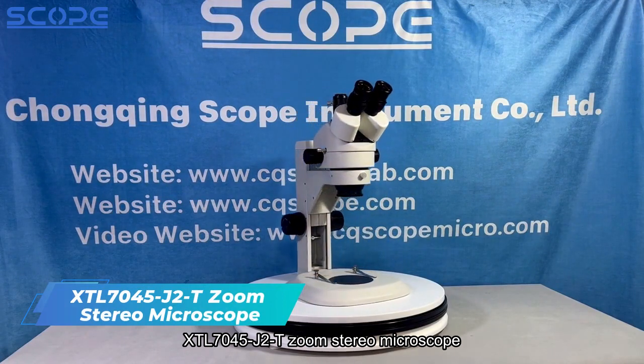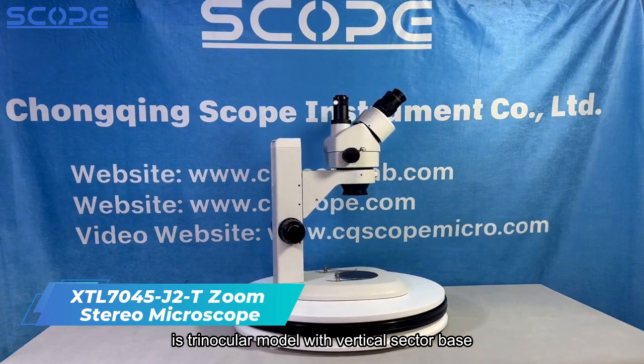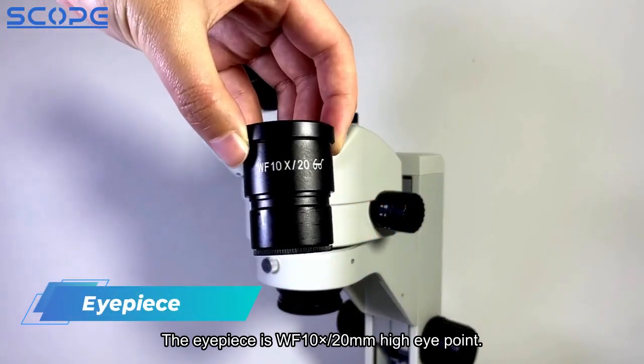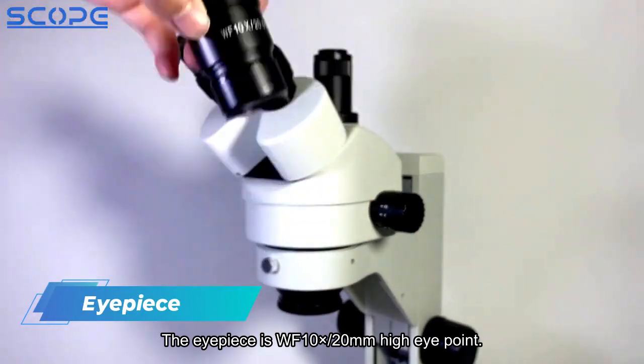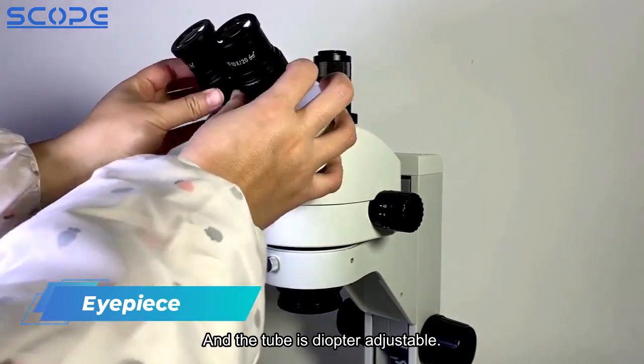XTL7045J2T Zoom Stereo Microscope is a trinocular model with vertical sector base. The eyepiece is WF10x, 20mm high eyepoint, and the tube is diopter adjustable.